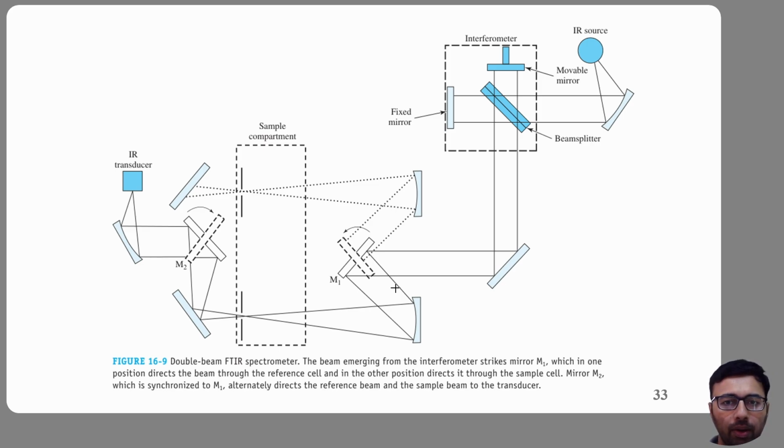Then, what is the purpose of the double beam design? Why was this useful? Because older instruments suffered from source intensity fluctuations, detector instability, and environmental drift. By continuously comparing the sample signal with the reference signal, the instrument automatically compensated for these variations.